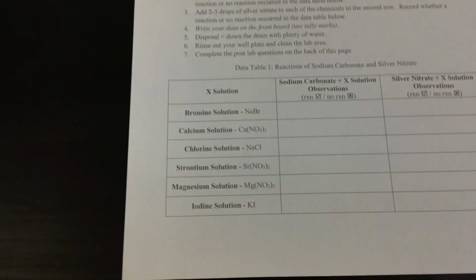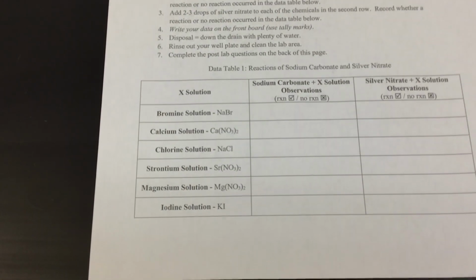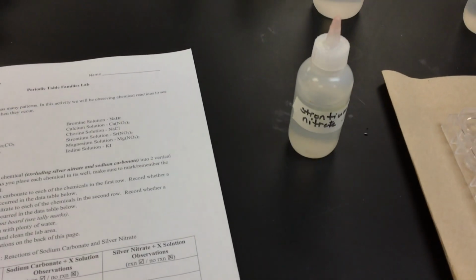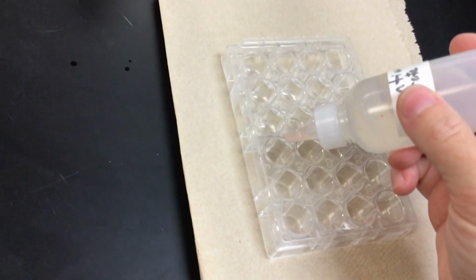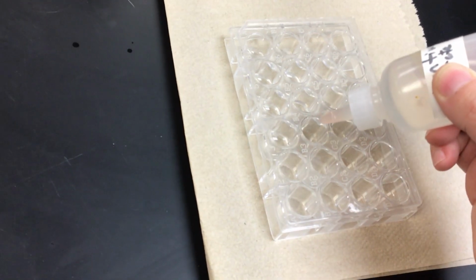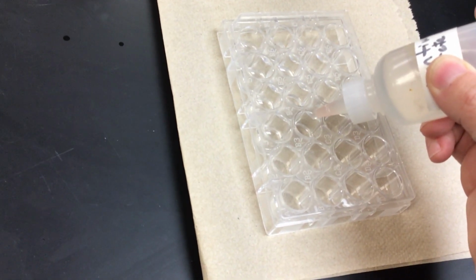Then we have the strontium solution. Here we are with the strontium nitrate in the third well. Oop, I put a little too much in here.